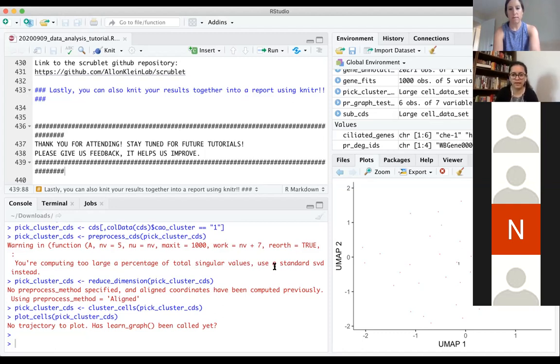Other members of my lab get similar results. Adjusting Q value or resolution does not help with this issue. Do you have any suggestions on how to approach this? So my very basic question would be, is it time series data or data in which you clearly know that you're going to have a progression or variability seen at every step of the way or the path?